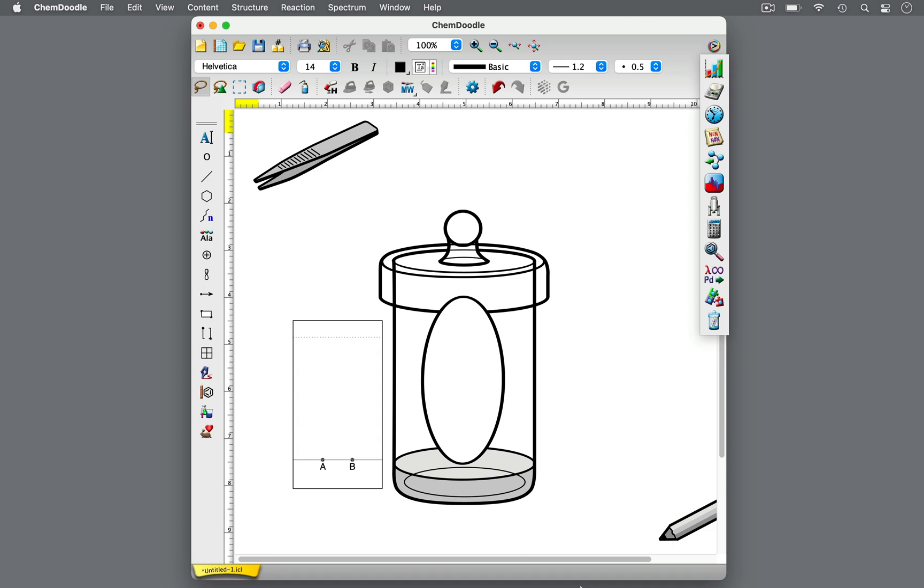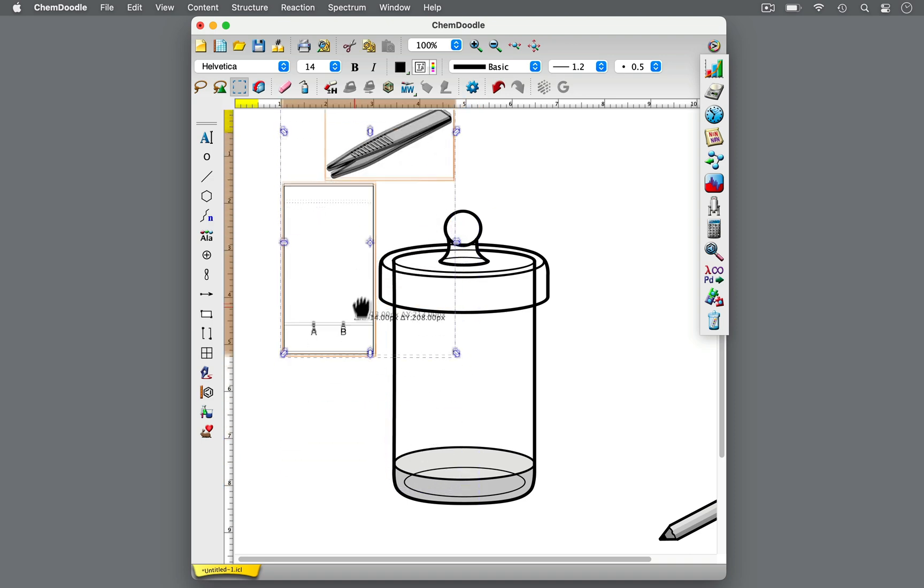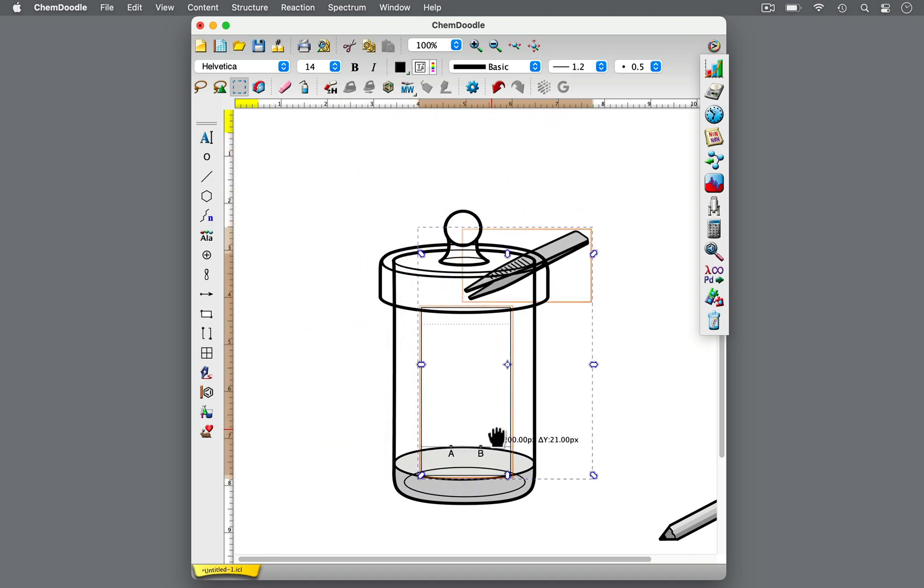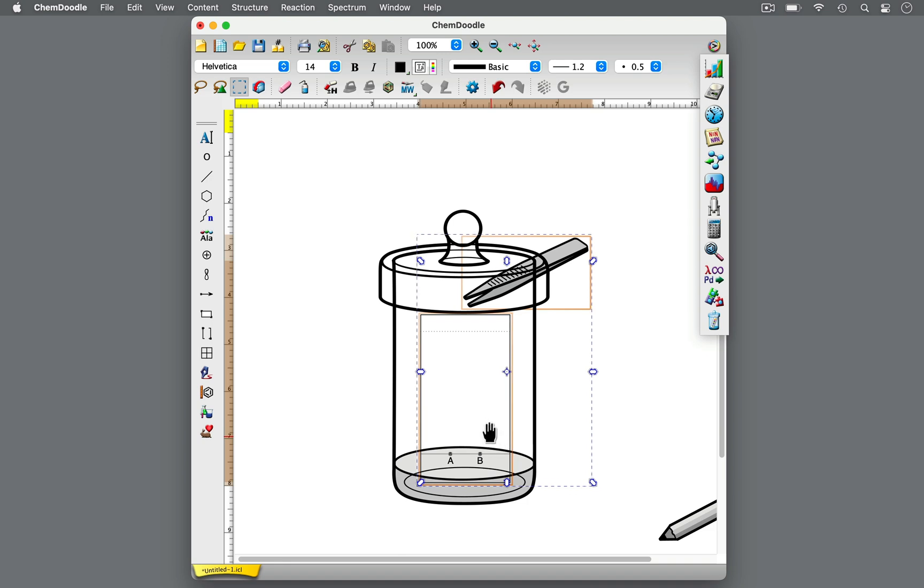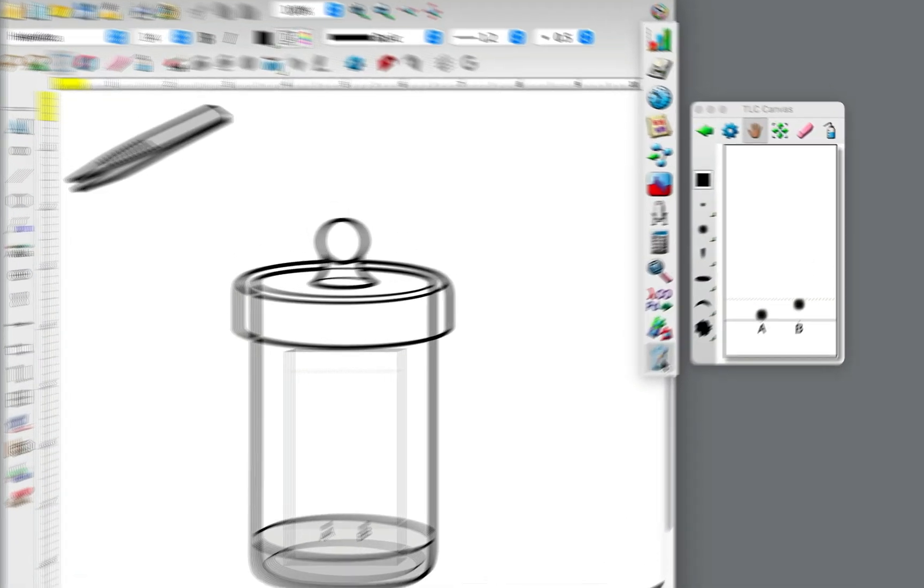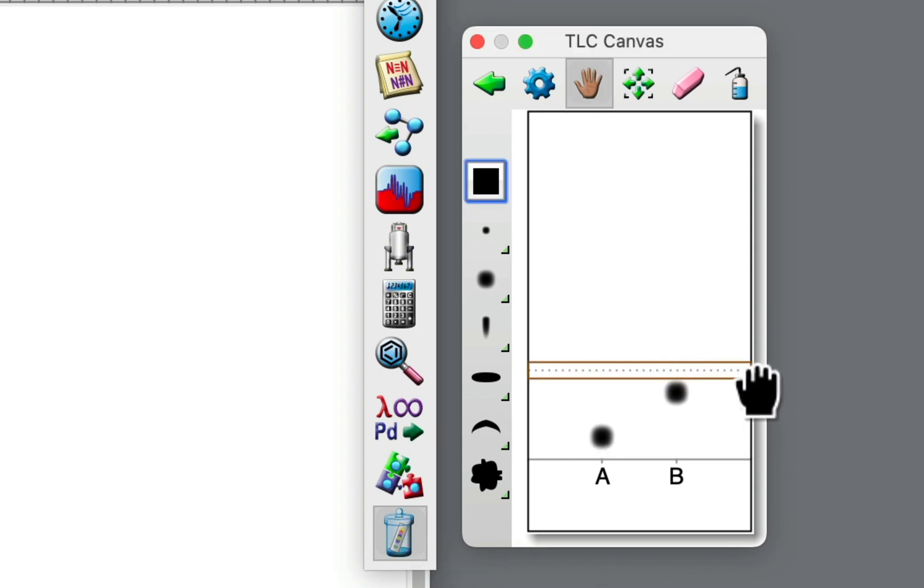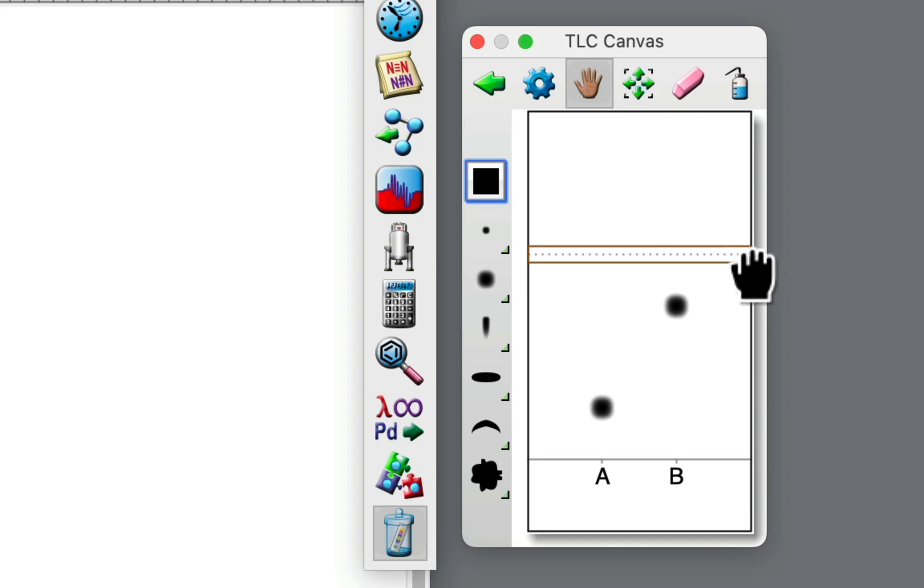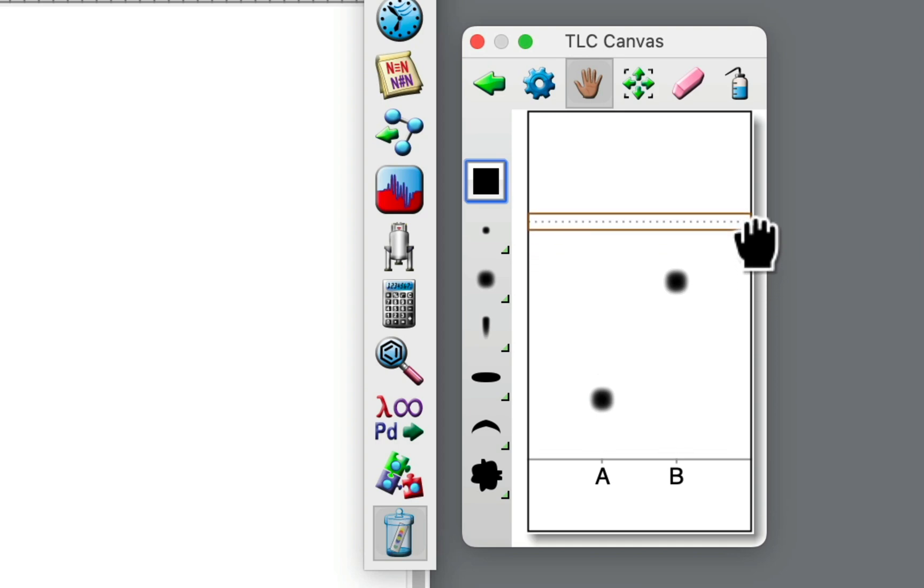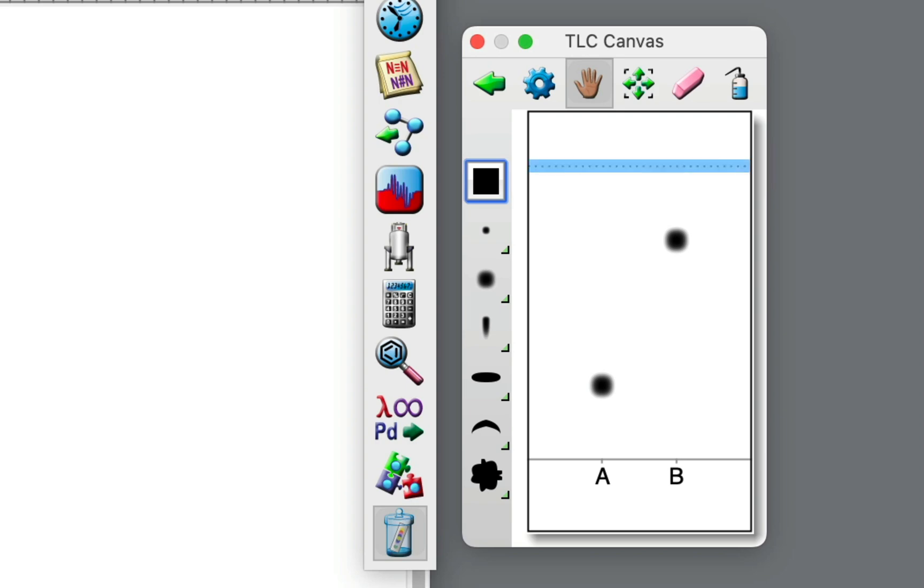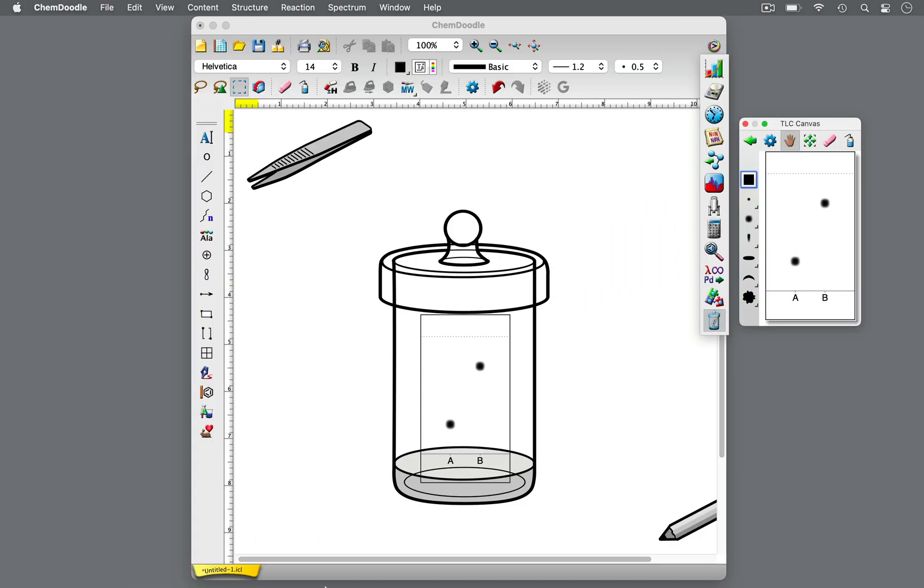Once the environment in the TLC chamber is saturated, using forceps, lower the upright TLC plate into the chamber such that the bottom edge of the TLC plate is parallel to the solvent level, and then cover the chamber to minimize evaporation. Avoid splashing the solvent on the TLC plate. The solvent, or eluent, will immediately travel up the TLC plate by capillary action, moving the samples along the stationary phase at different rates. Compounds travel at different rates due to differences in the interactions with the stationary phase and the mobile phase. As the mobile phase migrates up, the TLC plate will appear wet and a bit transparent. The wet moving edge of the solvent is called the solvent front.